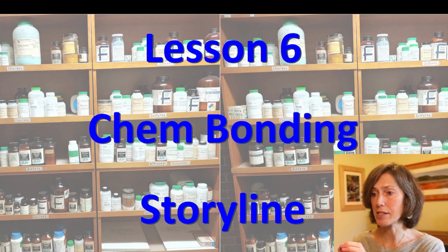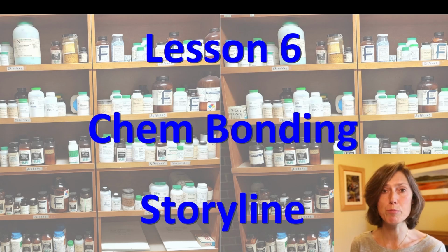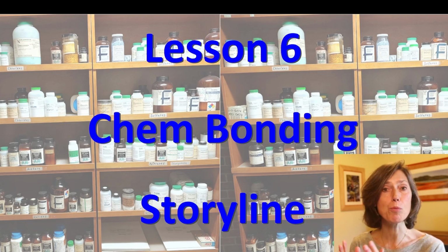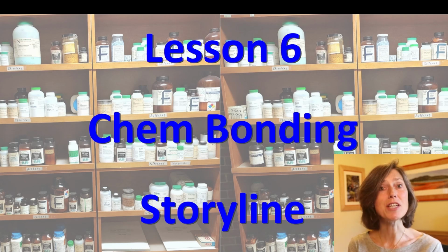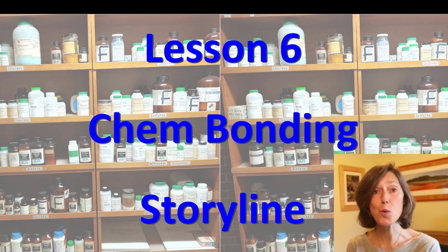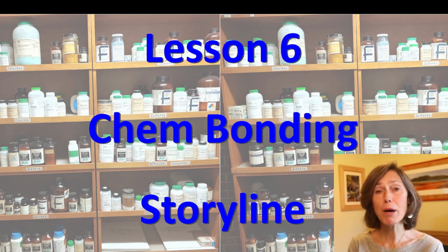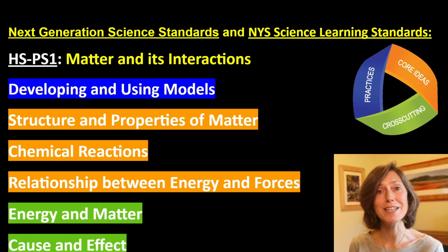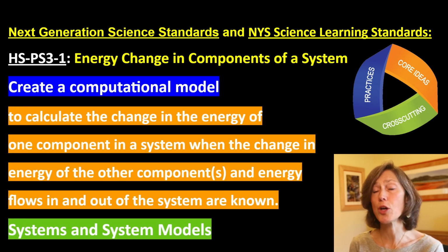In conclusion, lesson 6 of the chemical bonding storyline enables you to dissolve various kinds of ionic compounds in water, and students can observe the changes in temperature, whether it's a rise or a drop compared to the starting room temperature. It also gives students the opportunity to become familiar with the actual chemical bottles and the hazard labels. And it enables you as a teacher to emphasize the safety procedures needed when working with these various chemicals. And you can choose yourself how hazardous or non-hazardous you wish to make this particular lesson by picking various chemicals for students to dissolve. As always, this storyline centers around two key Next Generation Science Standards, including matter and its interactions, as well as energy change in components of a system.